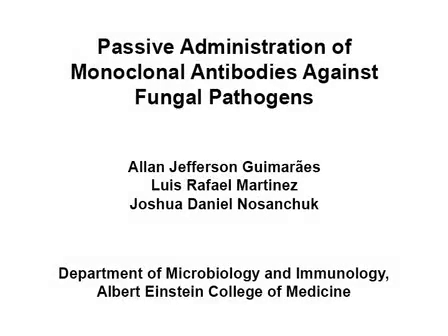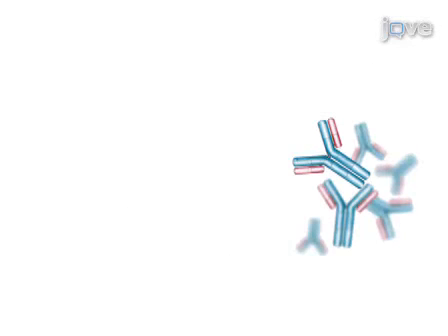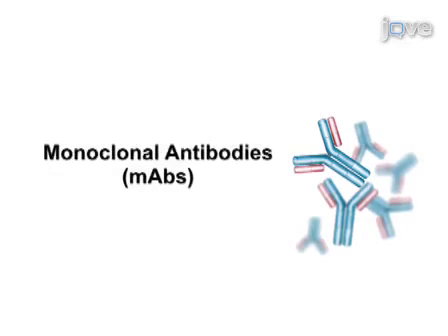The overall goal of this procedure is to advance our capacity to protect individuals with antibodies or vaccines for preventing or treating histoplasmosis, and to examine the role of virulence factors in disease pathogenesis. This is accomplished by first isolating and characterizing monoclonal antibodies to target antigens.